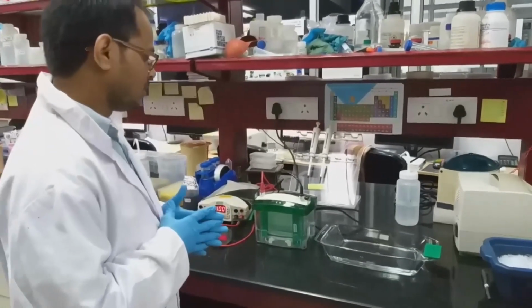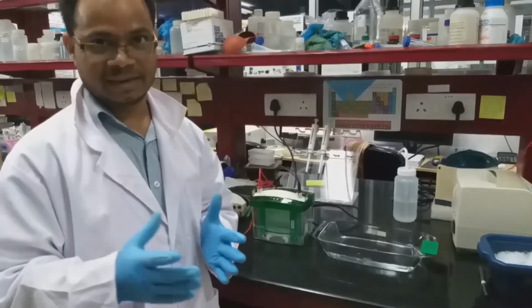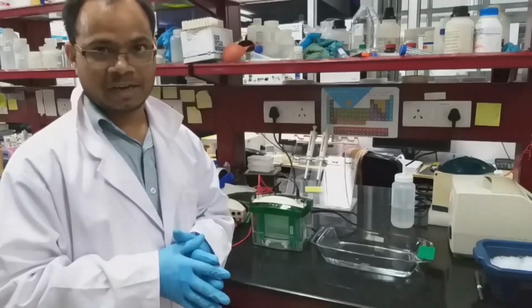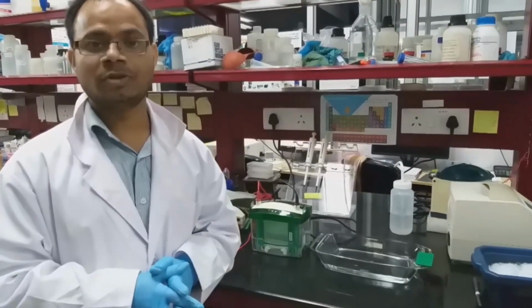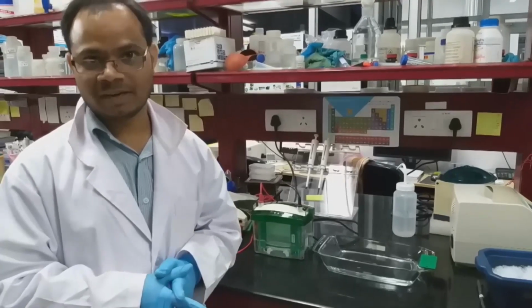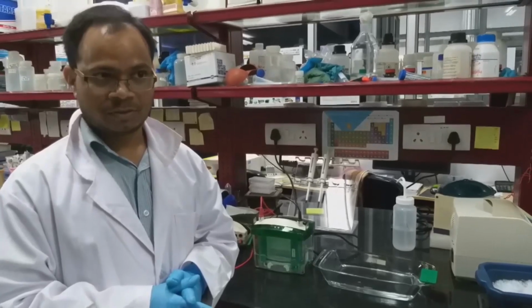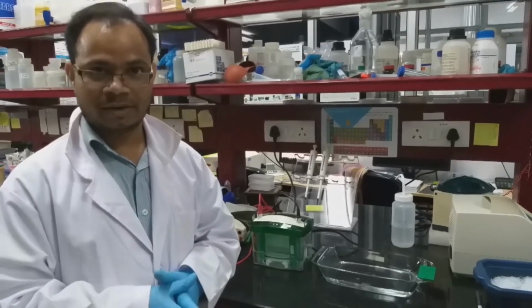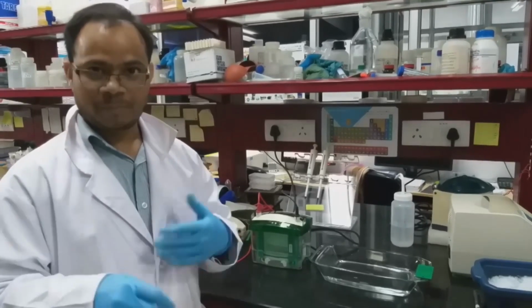Generally there are two ways of staining and destaining. One is quick staining, where we heat the gel with the staining solution, which contains Coomassie brilliant blue along with methanol and water. Then we destain with water by heating.